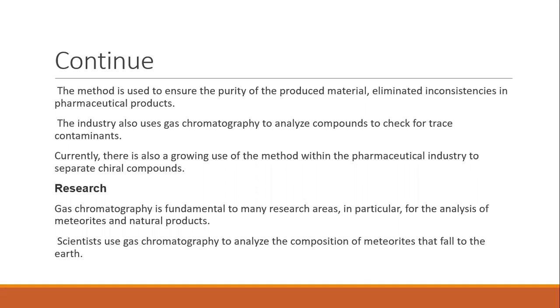Producers of chemicals also heavily rely on gas chromatography, particularly when making emulsifiers, solvents, and co-solvents, to ensure that they maintain the same quality when production is scaled up.